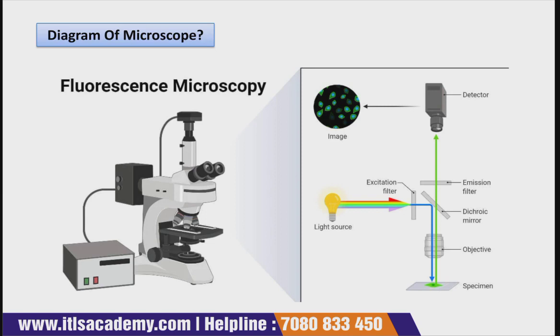It has an excitation filter and an emission filter, a dichroic mirror, objective lenses, and at the end a specimen. Here the light source uses different types of fluorescence, and with the help of this fluorescence the detector detects the sample.